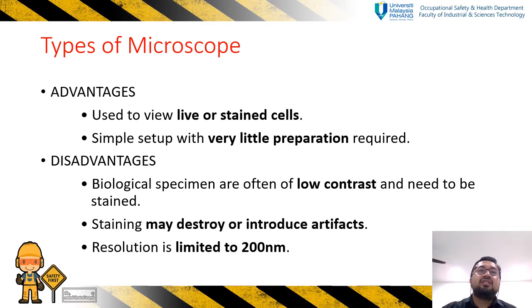Okay. The advantage of the bright field microscope is that it is used to view live or stained cells.